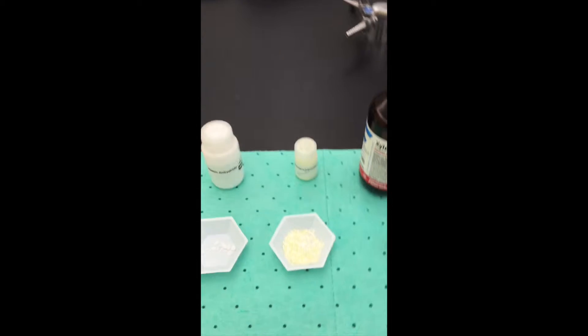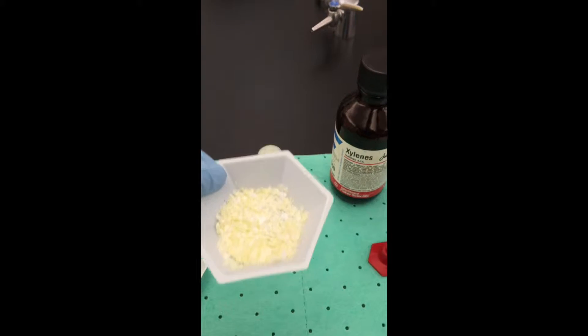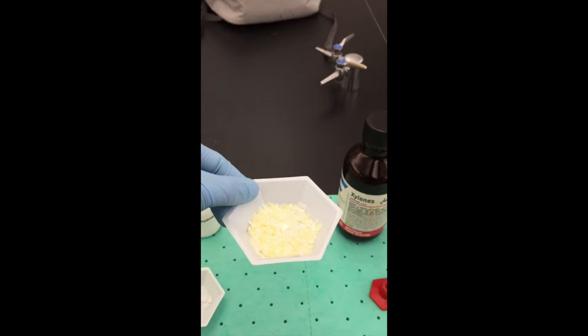Okay, this is the Diels-Alder reaction. We are going to combine a boiling chip with one gram, which is four millimoles, of 1,4-diphenylbutadiene.